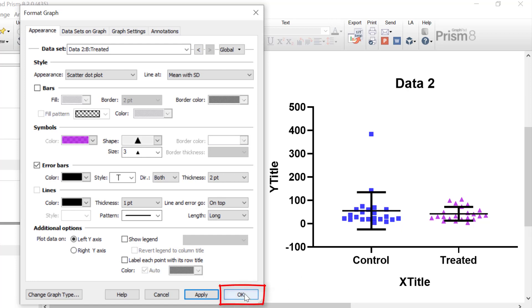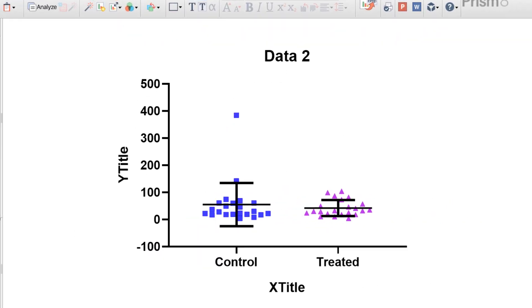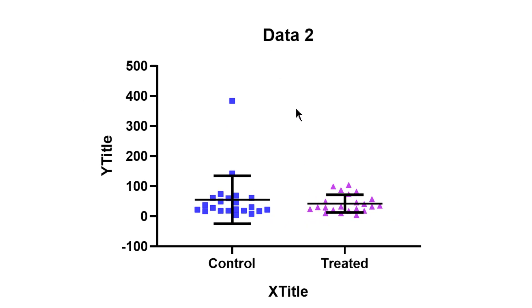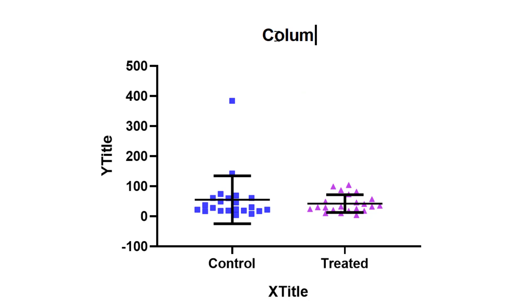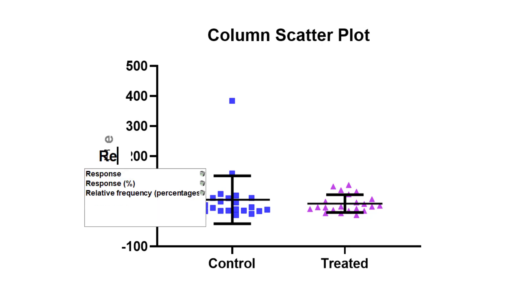I'm happy with this and I'll click OK to return to the graph. Let's start off by giving the graph a title — 'column scatterplot' — and I'll delete the x-axis title since I don't really need that. I'll also give the y-axis a title and call it 'response'.